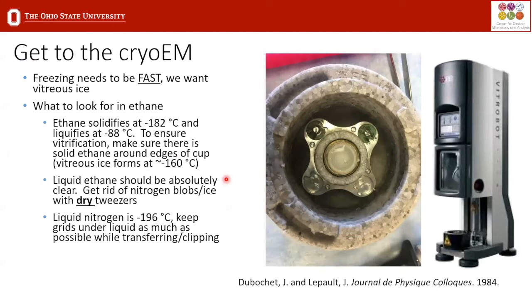So now let's get to the cryo-EM. So you've done your purification, you've done your negative stain, you know your ideal sample buffer and storage conditions, and you're ready to see what this looks like in cryo-EM. For cryo-EM, when you freeze your sample, the freezing absolutely has to be fast because you want vitreous ice.